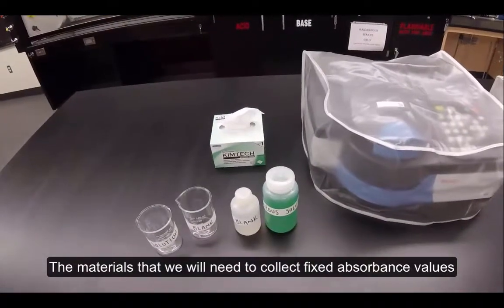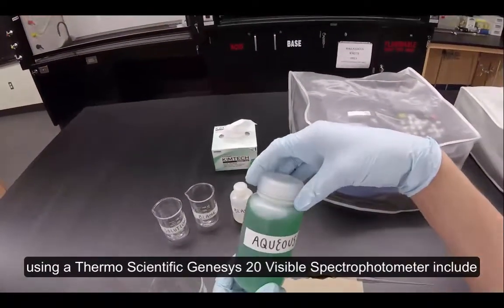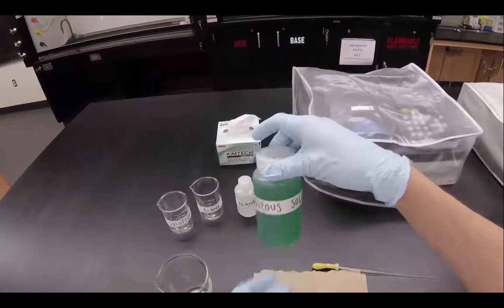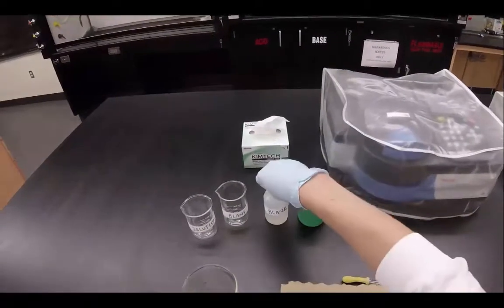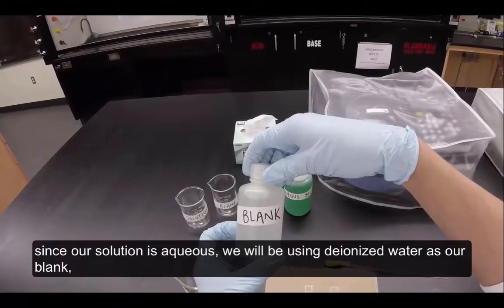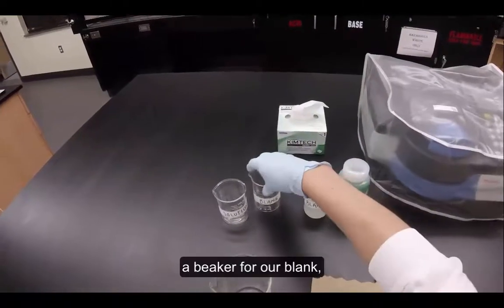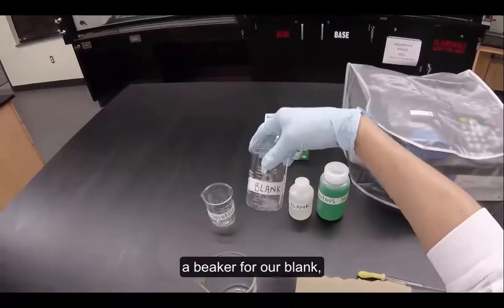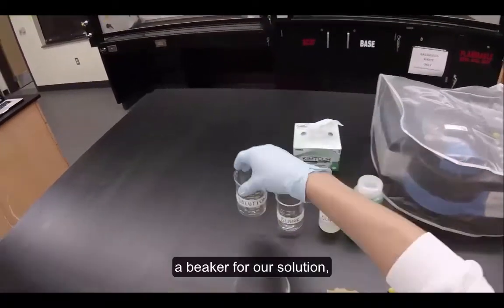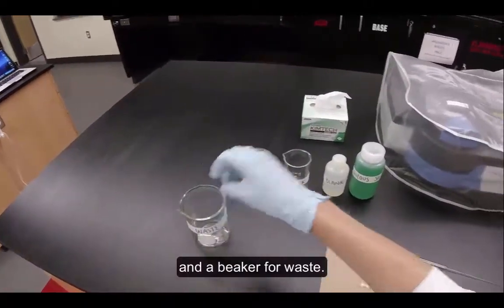The materials we will need to collect fixed absorbance values using a ThermoScientific Genesis 20 visible spectrophotometer include our solution, a blank for our solution. Since our solution is aqueous, we'll be using deionized water as our blank, a beaker for our blank, a beaker for our solution, and a beaker for waste.